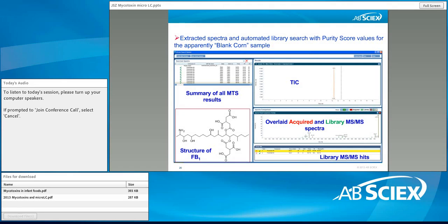Okay, with this slide, I just want to show you a further possibility with this instrument, which is when you are using the linear ion trap. Without going very deep into the principle of the linear ion trap or how it works, just from this spectrum, when you slightly modify the method I presented before, just adding one extra experiment using the linear ion trap, you can get a high-quality full-scan MS/MS spectrum.